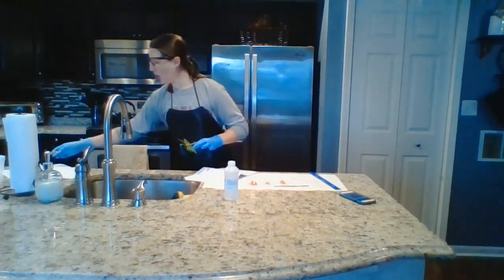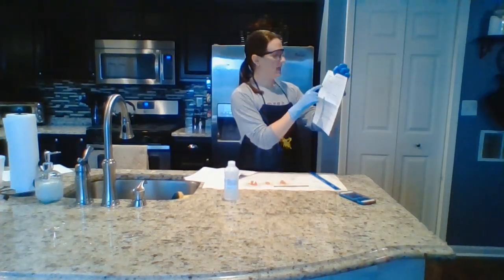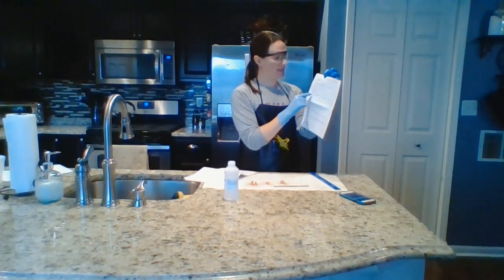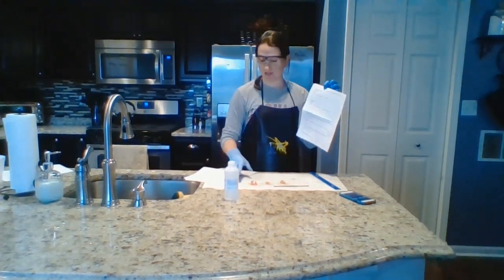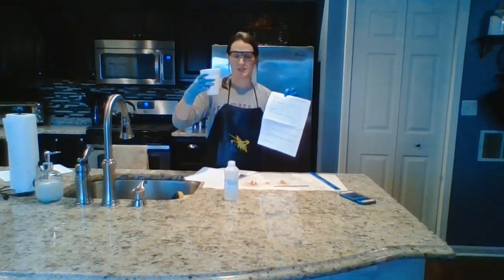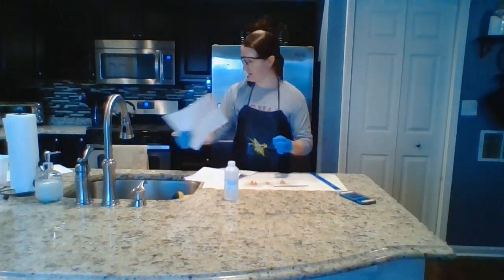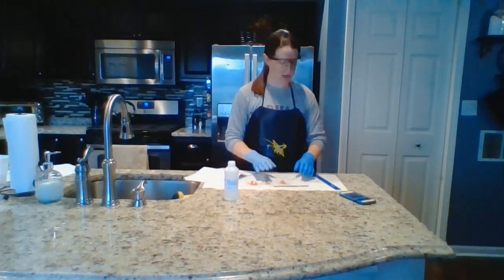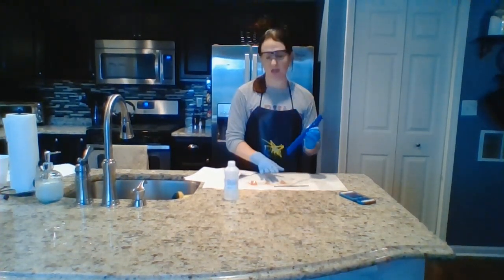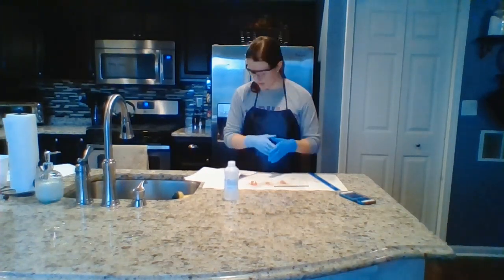Don't forget, I will always record my observations in data table 4 for my 5-minute part 1, and in data table 5 when I do a 10-minute version of the same thing. So data table 4 and data table 5, I fill out my measurements. Always use centimeters, the smaller section on your ruler, and try to measure as best you can, even if your cubes are not super solid or super cube-like.